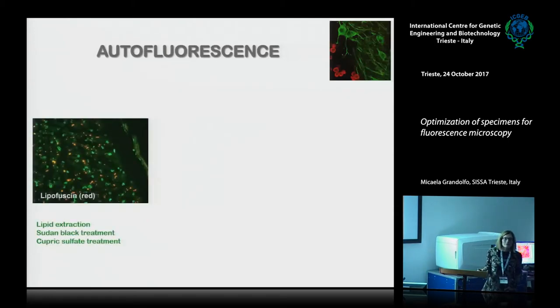Is it dependent also on exposure time? We can expect exposure time to be involved in the background. So if you reduce the exposure time, yes, you can play with the acquisition, but yes, of course.